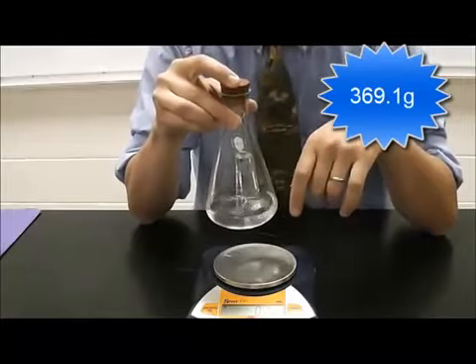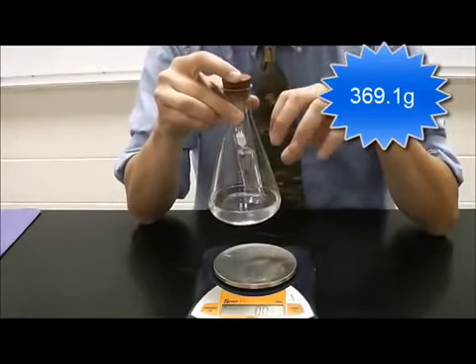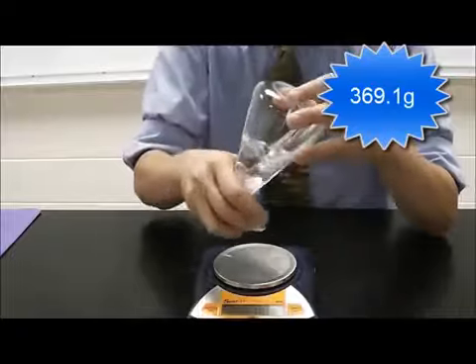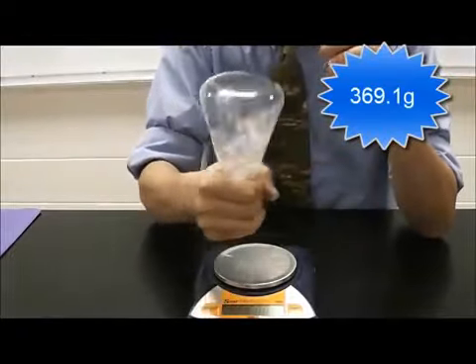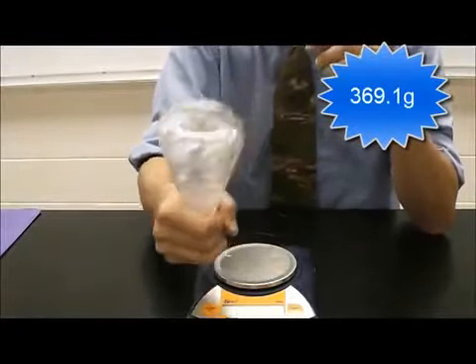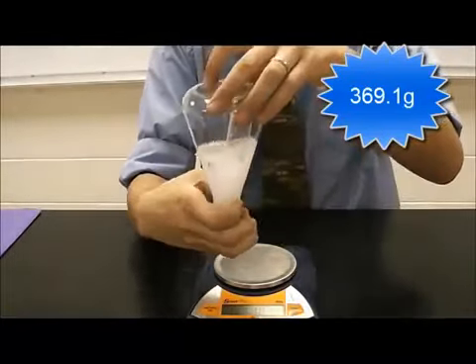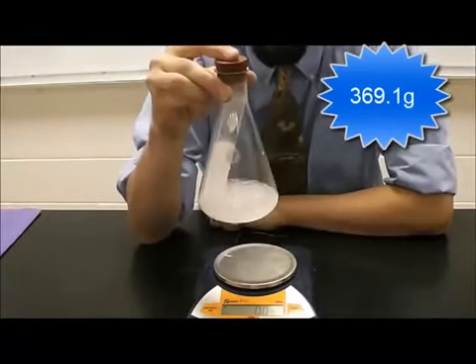Also, in order to get these two solutions to actually mix, I have to flip it upside down. So I'm going to flip it upside down, carefully agitate so that the two solutions actually mix. And you can see there's a pretty startling reaction here.